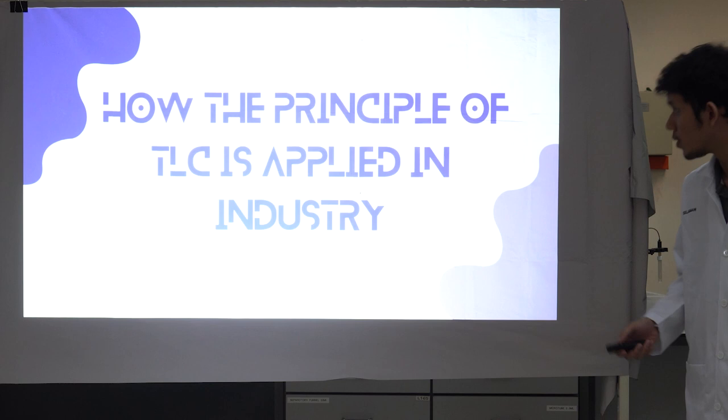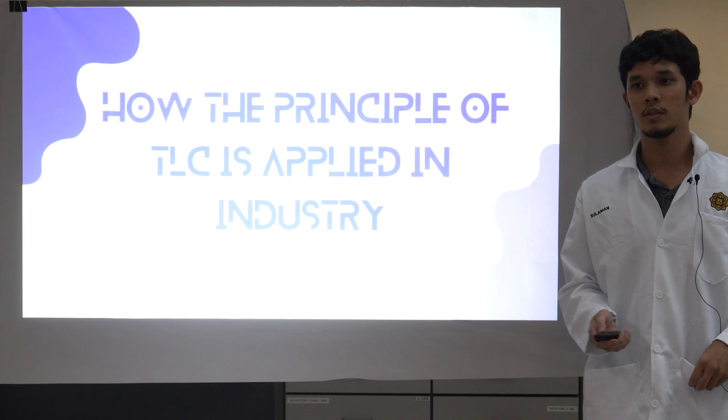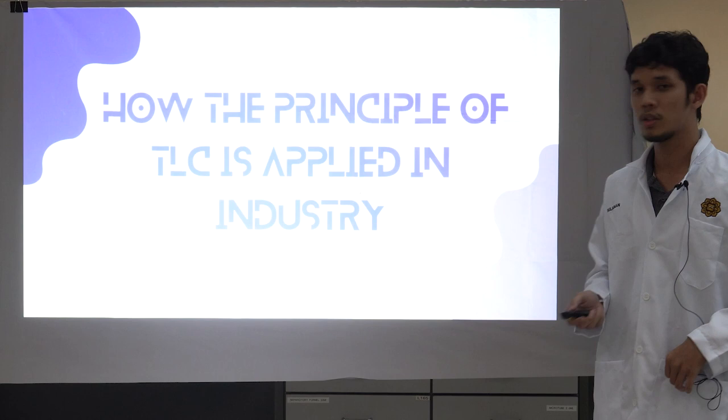Assalamualaikum. My name is Muhammad Aziz. For your information, TLC is widely used in various fields such as food, pharmaceutical, and clinical analysis, because it is easy and quick. Let's go to the principle.